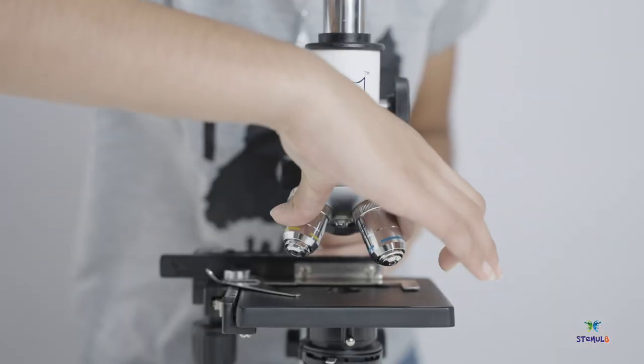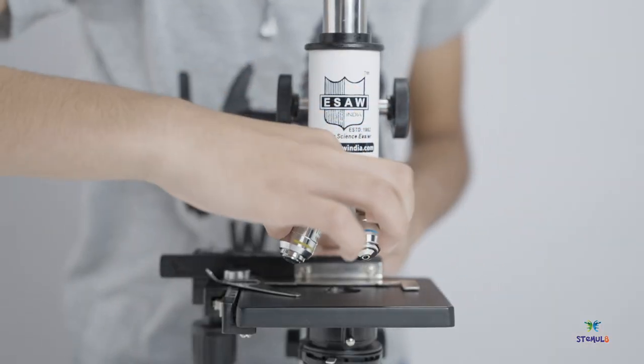Next, turn the revolving nose piece to adjust the lowest magnification objective lens in position.